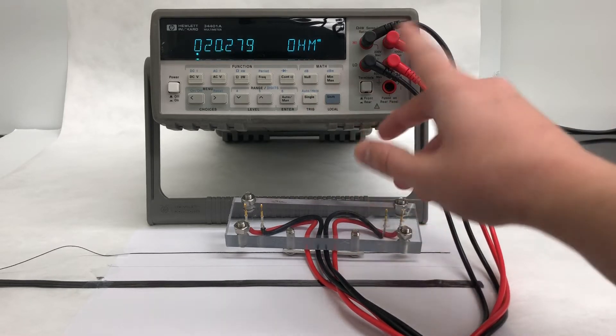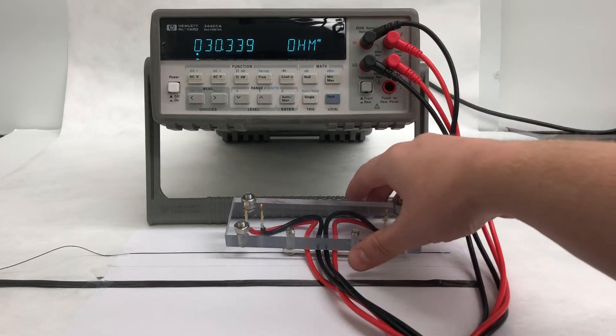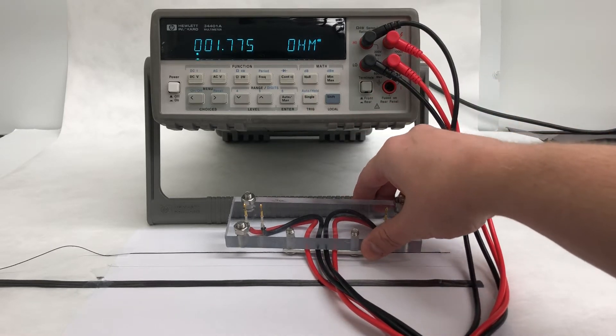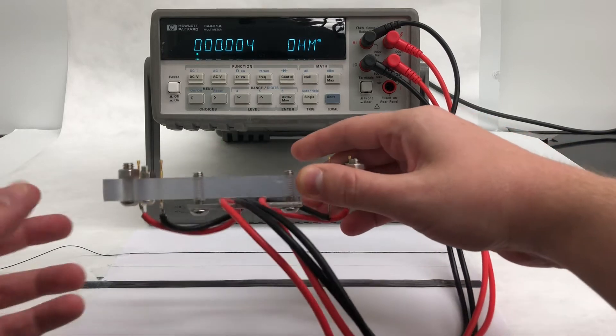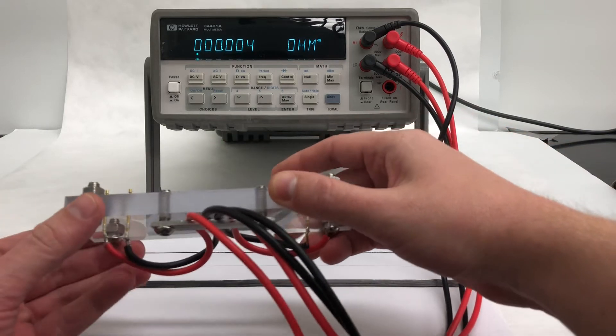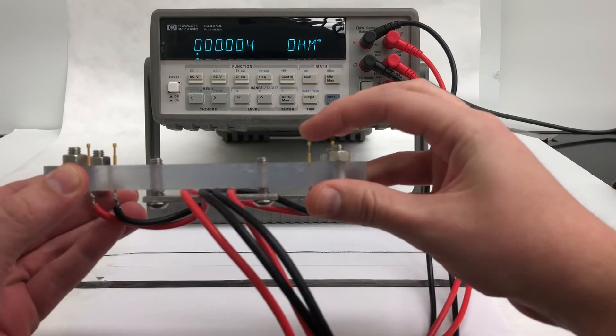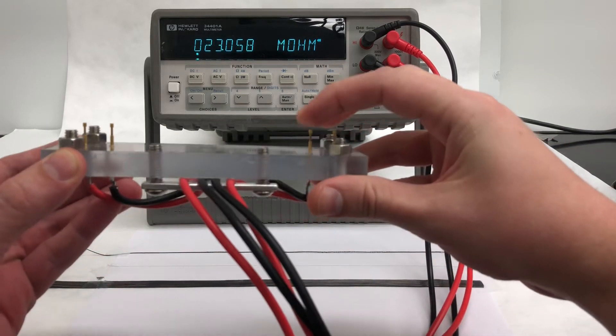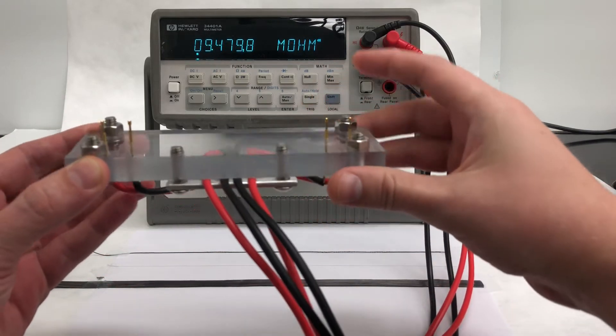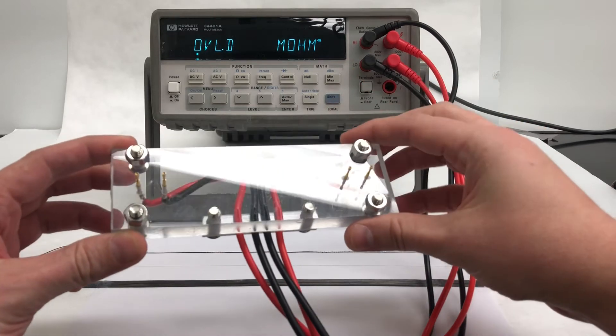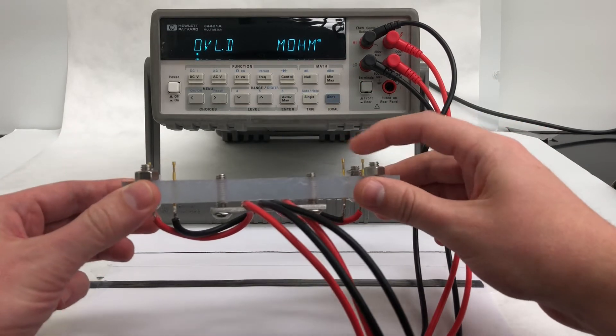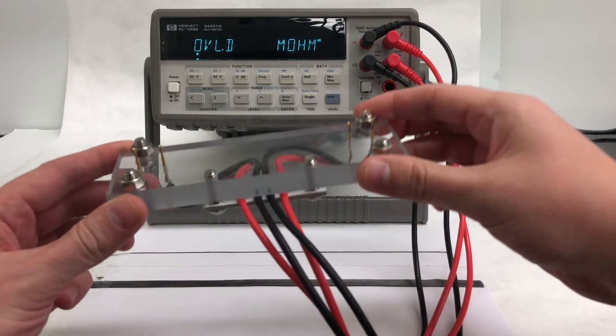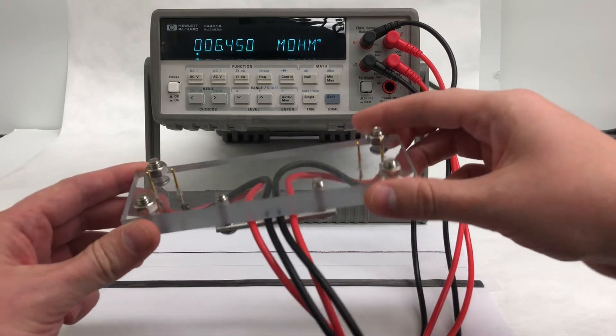This probe has four electrical wires from the multimeter connected to four spring-loaded electrical contacts, known as pogo pins, that are fixed in this plexiglass frame so that the distance between the pins always stays fixed.